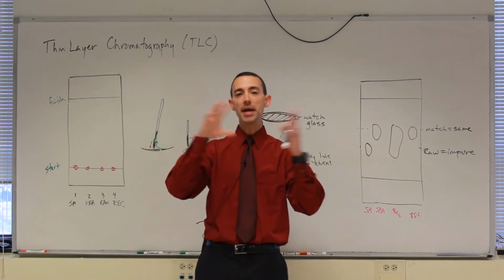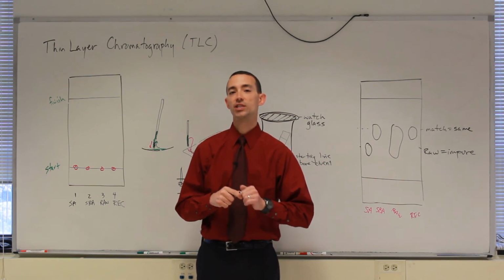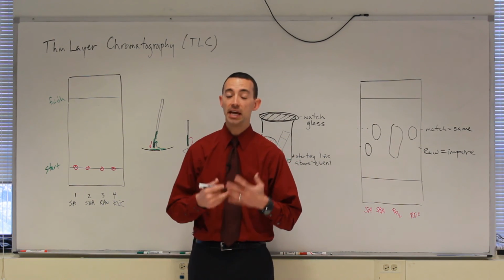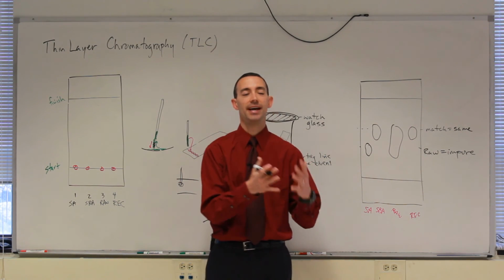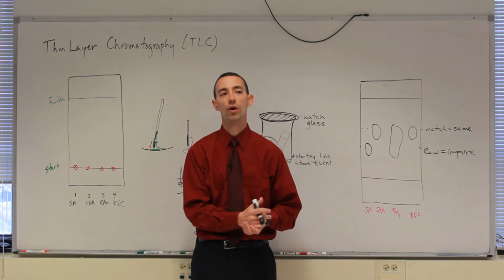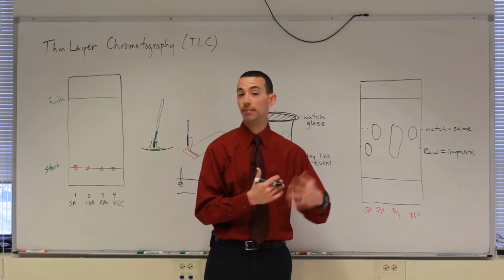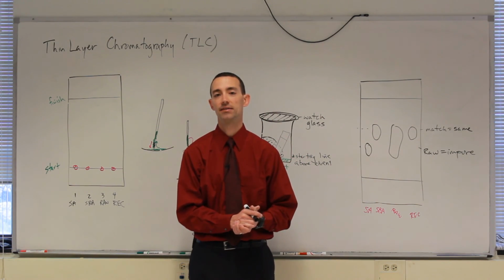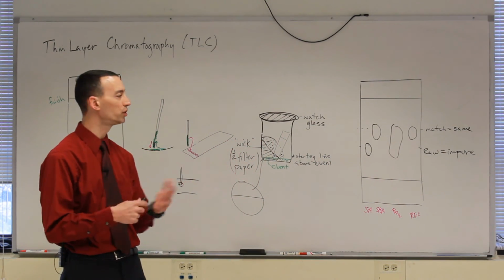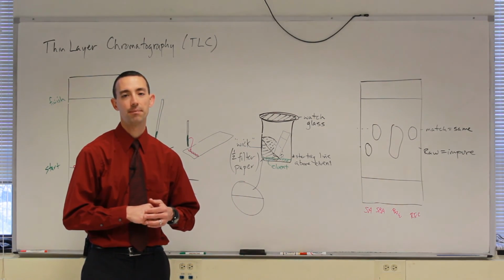Right? In the big picture, today's descriptive evidence that you're gathering is going to be used when you write your formal lab report to try to say, yes, I made aspirin, and here's the evidence that I have to support my claim that I made aspirin. Or to say, I made aspirin, but it wasn't a very pure sample, and here's why I can say that. Right? So it's evidence that you're going to use to support whatever your conclusion is about the quality of the product that you made last week in lab.